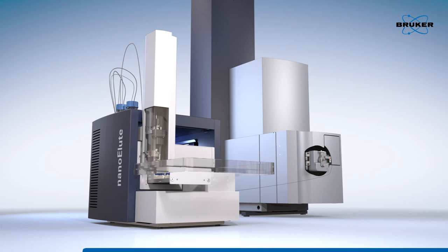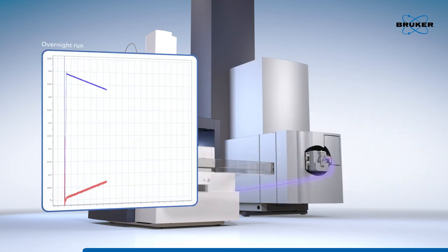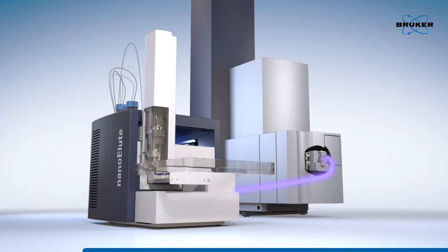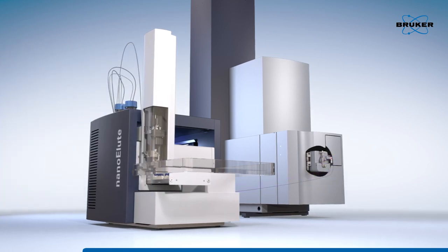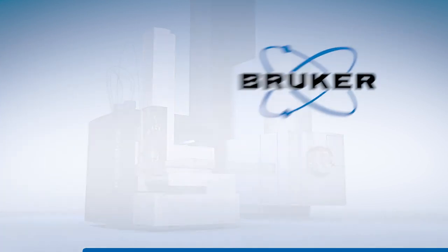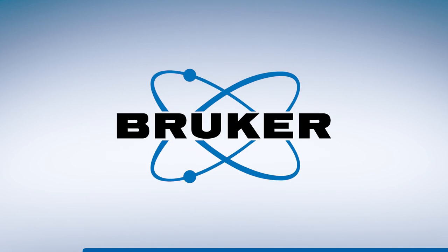NanoELUDE is the perfect companion for the Bruker Impact II UHR QTOF and the market-proven captive spray ionization source. Simply connect.